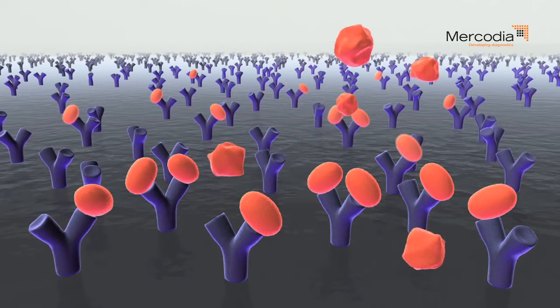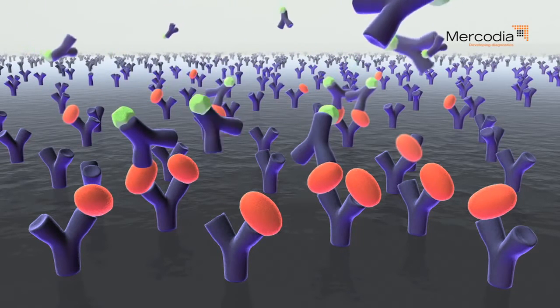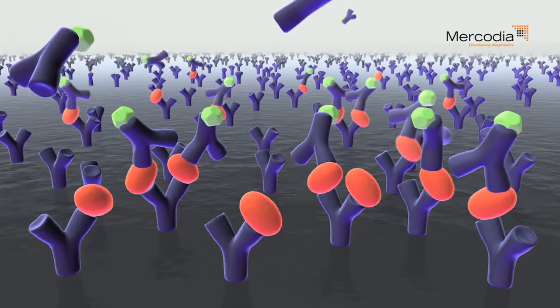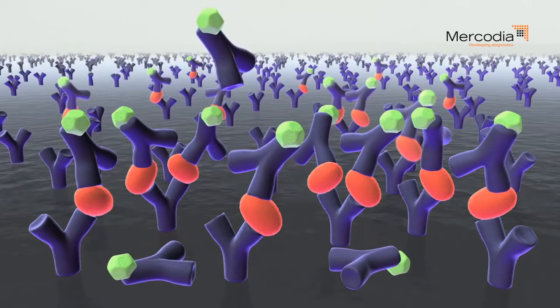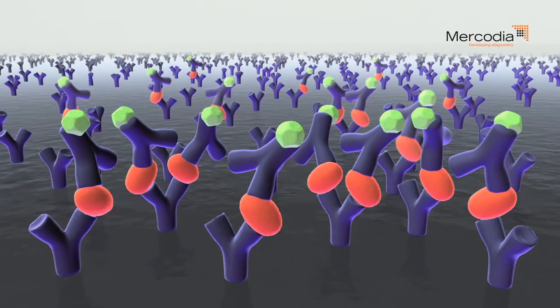Unbound compounds are removed by a washing procedure. The enzyme-linked detection antibody is added to the well. The detection antibody binds to a second epitope on the antigen. Unbound antibodies are removed by a washing procedure to avoid background signal produced by interference.